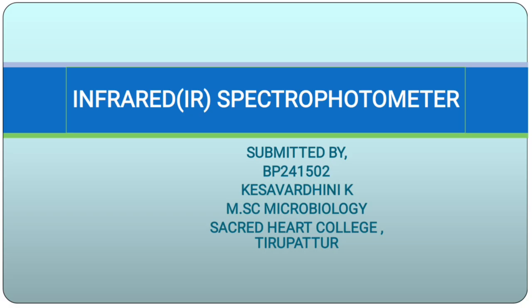An overview. Infrared spectroscopy is the study of absorption of IR radiation which results in the vibrational transition. It is also mainly used in determining the functional group. Now we are going to see the introduction, principle, types of infrared spectroscopy and instrumentation of spectroscopy.